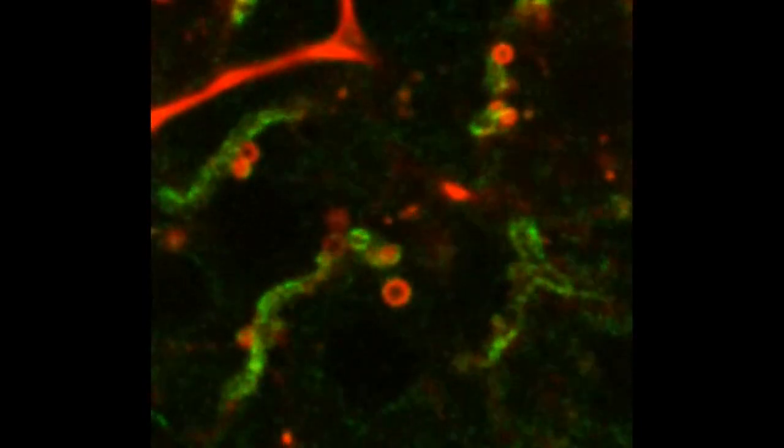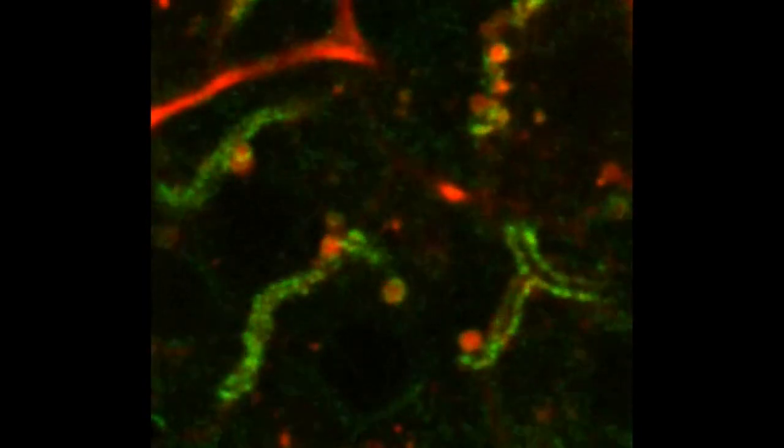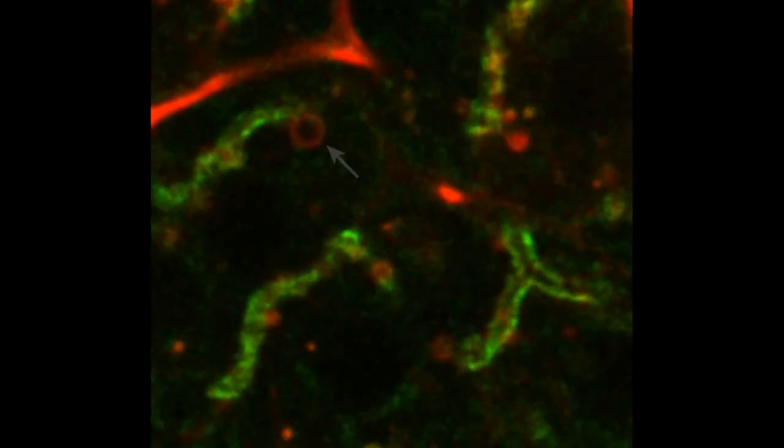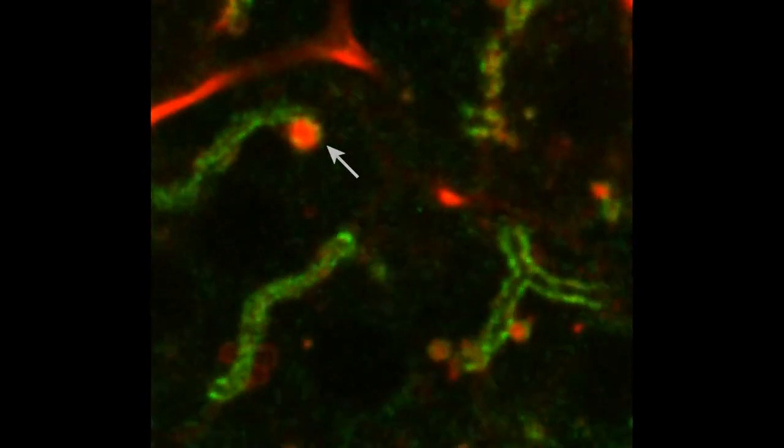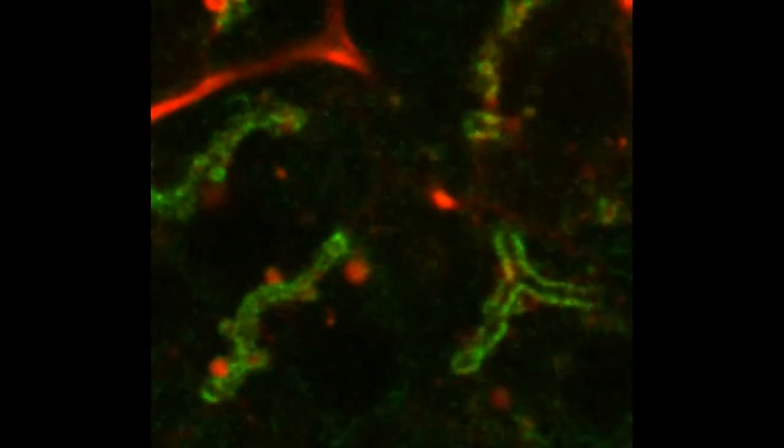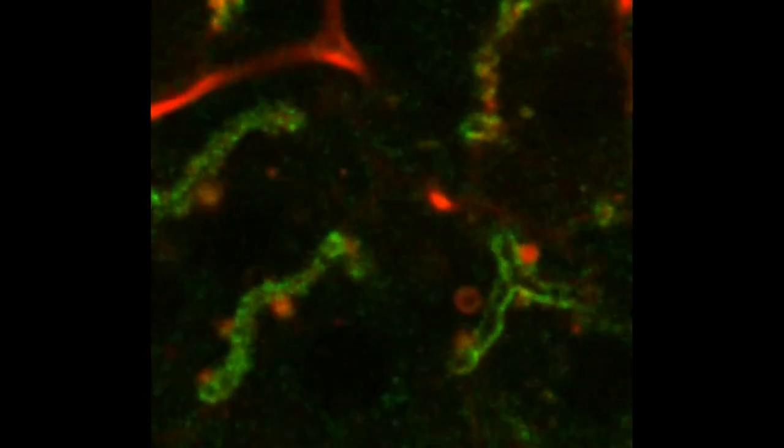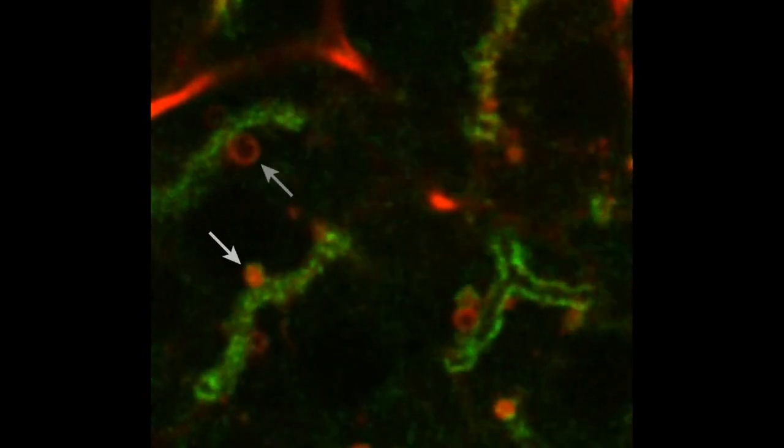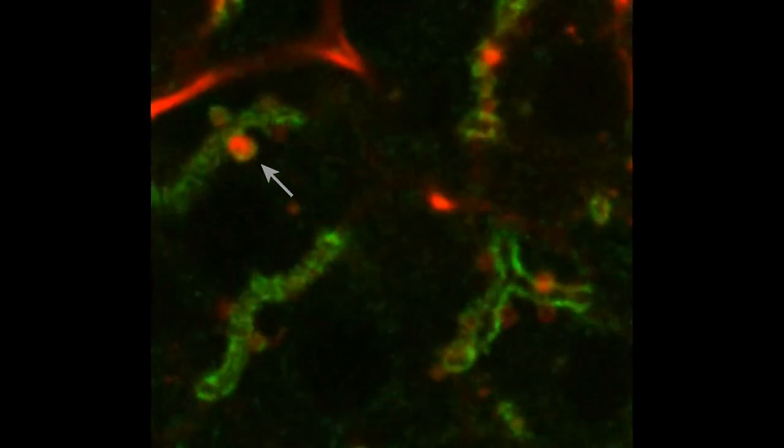We can also image how myosin-2 jumps on the granules after the actin filaments are assembled. In this video, we used a mouse that expresses fluorescent actin in red and fluorescent myosin-2 in green. The vesicles integrate into the plasma membrane after myosin-2 is recruited.